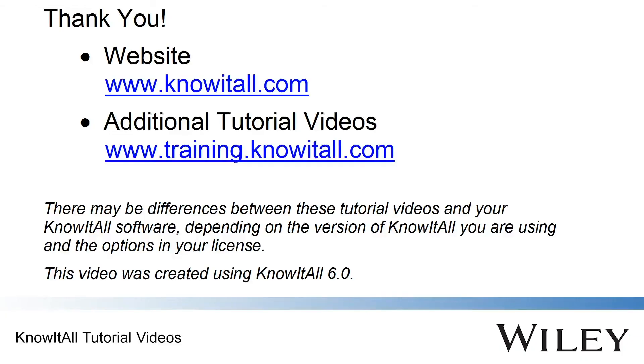This concludes our demonstration of how to perform a substructure search in the Know-It-All informatics system.